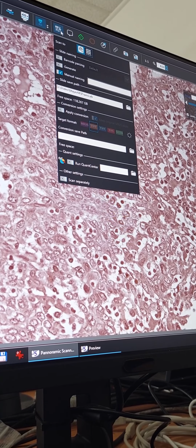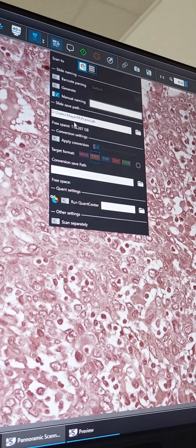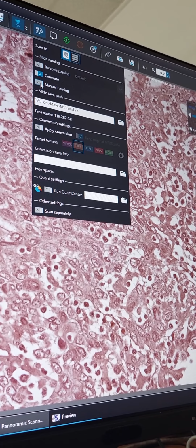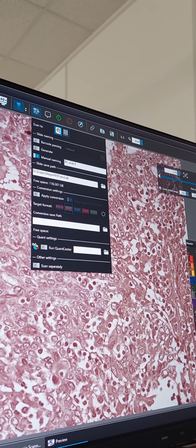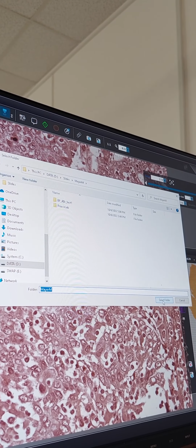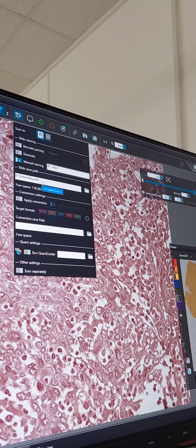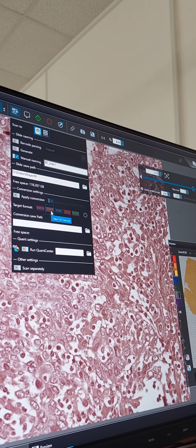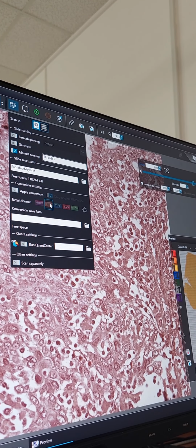Here you can set where you want your scan to be, and under what file name. You can generate a file name or have a manual file name. So this is going to be bright field slide 1 as the profile. And I can choose a folder. I'm going to choose this. So now we have a file name and the file path. You can also immediately make a conversion to any kind of image file format, but you can do that also later.